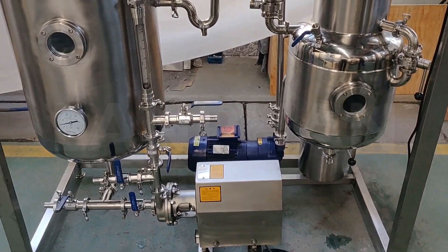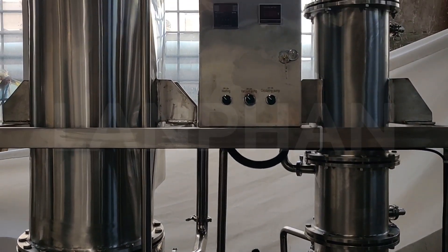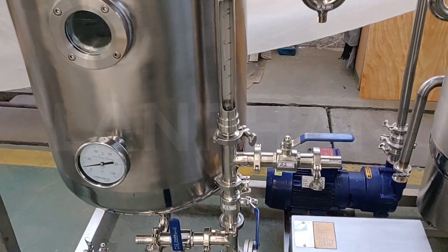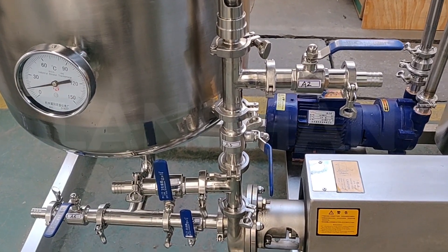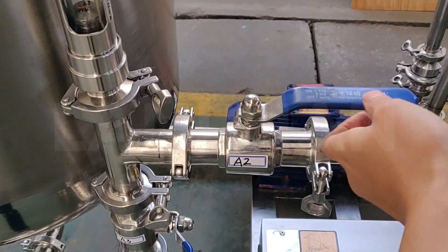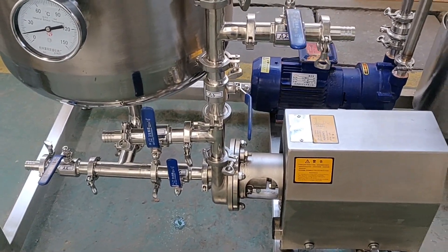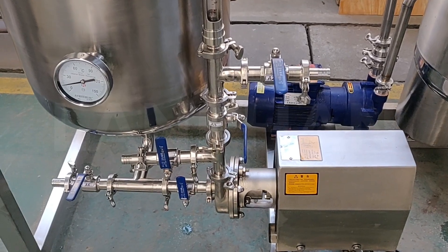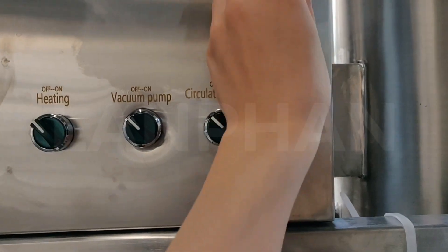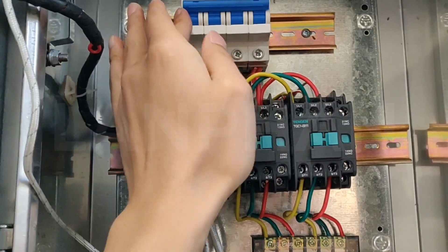Hello everyone, let's talk about the falling film. This one is a 20-liter falling film evaporator. In the first step, we need to check all the valves — they should be in the right condition. All valves should be closed. After finishing the checking, we open the control cabinet and turn on the switch.